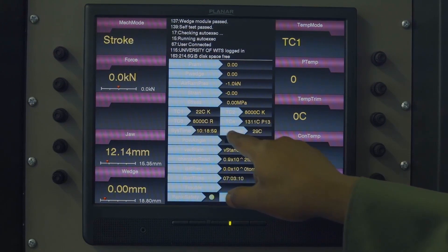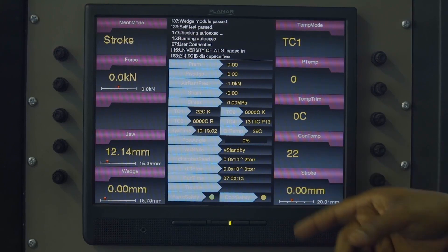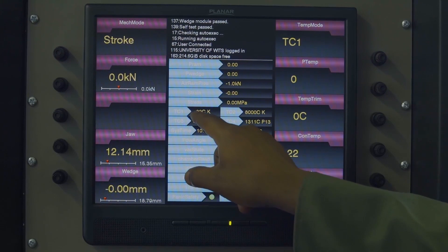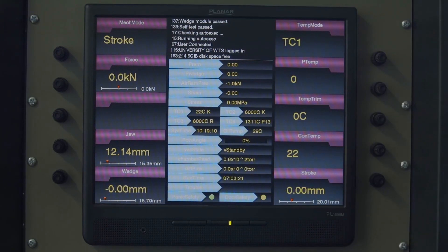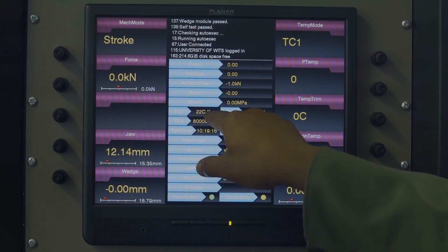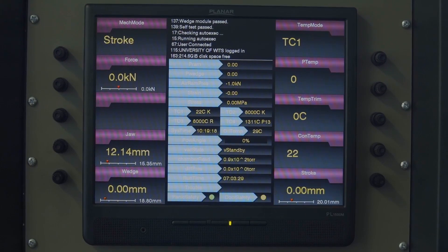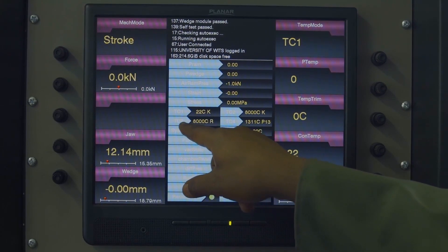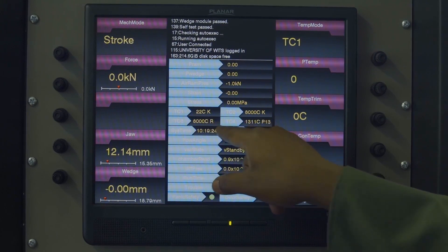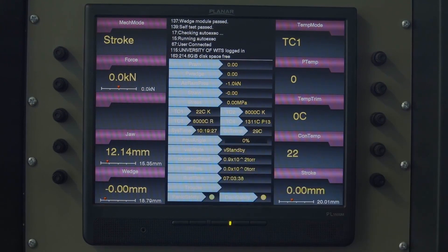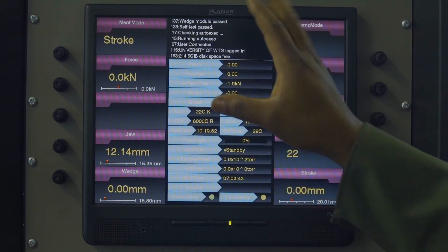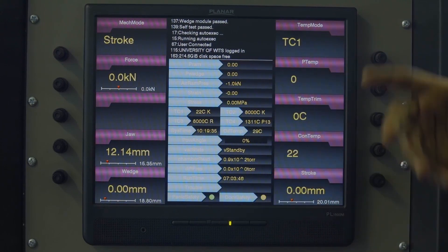During the experiment as you heat up, this will continue to go up. You can also see it here, it will continue going up until you reach the targeted temperature. You have K here indicating that it's a K-type thermocouple. The TC3 is representing the outer thermocouple, but we are not using that for now. We are only using the TC1 thermocouple. We will still come back to this console to take you through what's happening as we continue to run the experiment.